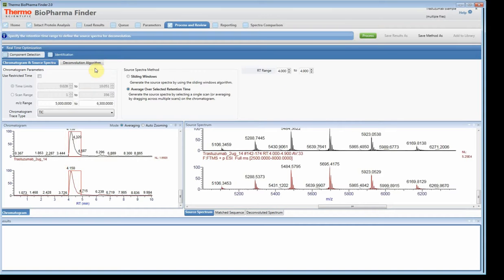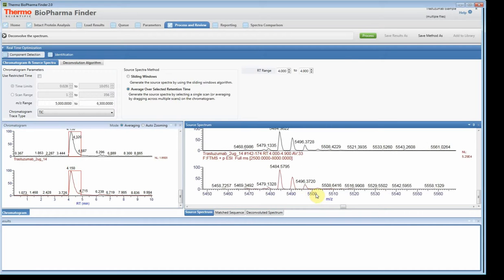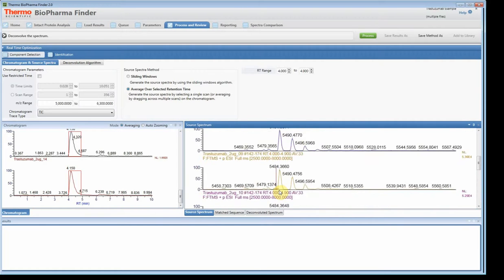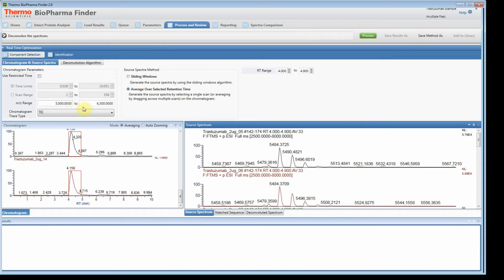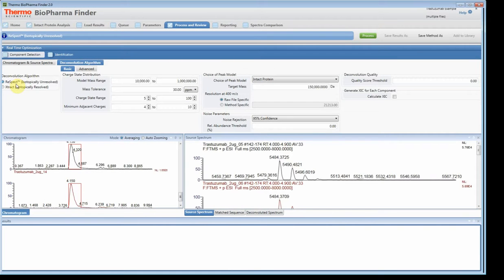Now that we have our source spectrum, and all the files look good, that's something you want to check — make sure all of them have a good source spectrum. If they don't, check the m/z range and time parameters for your raw files. Now let's go to the deconvolution. We're doing RESPECT. The first place I start is the model mass range — this should be around the molecule of interest. The protein is around 148,000, so I'll set the target mass to 150,000. I'm not expecting any dimers, so I'll set the upper limit to 160,000 and the lower limit to 140,000.